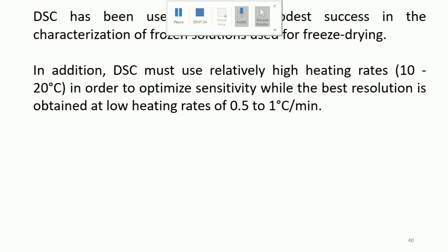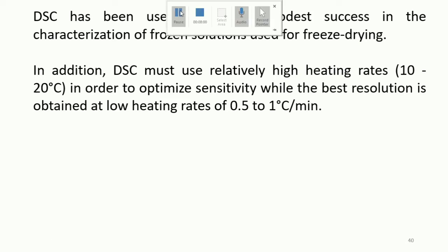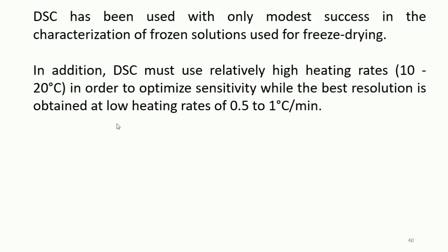The combination of two heating rates allows the operator to select a slow average heating rate in order to obtain good resolution, and a higher modulated heating rate to obtain increased sensitivity during the same experiment.